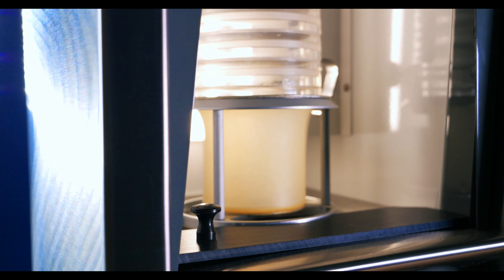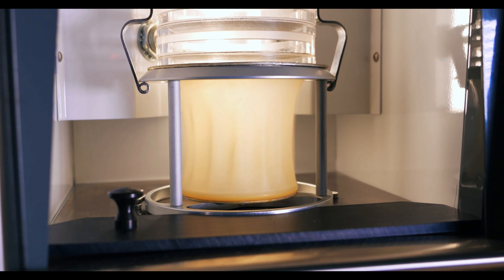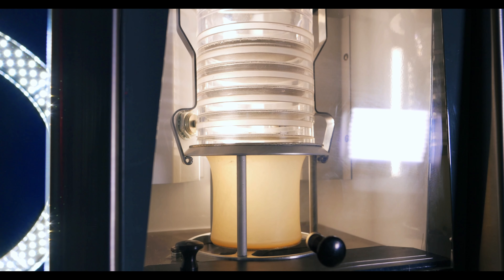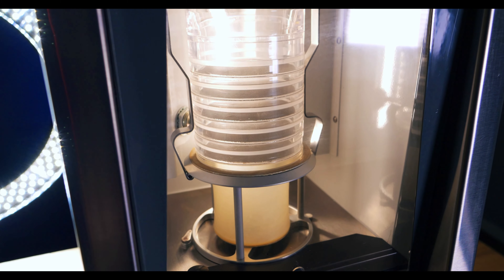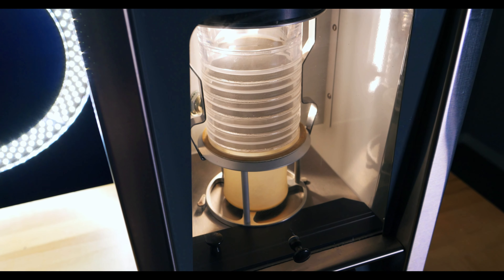Since sonic sifters carry out particle analysis similar to the Alpine, this leaves the unit with a significant advantage when working with agglomerating material. The airflow inside of a sonic sifter does a better job at separating individual particles that tend to agglomerate, much more than the motion from a sieve shaker. Sonic sifters can also prove to be more efficient than Alpine Airjet sieves, as they don't require the time-consuming process of testing the material individual sieve by sieve.